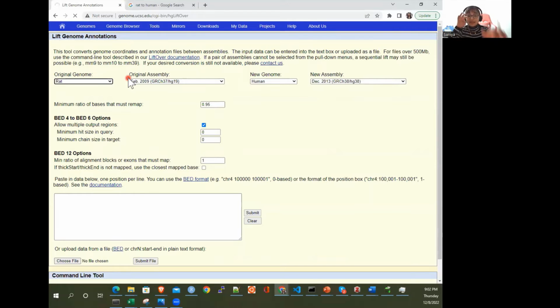And then in the second conversion, I'm going to take those hg19 coordinates, and then I'm going to map them to hg38. And even between these builds and assemblies, as you can see, even for the same species, technologies improve as well. Like we go from this microarray data for gene expression to RNA-seq levels, that could be in bulk in tissues. And now people are going inside and collecting the single cell data as well. And the data is always getting better.